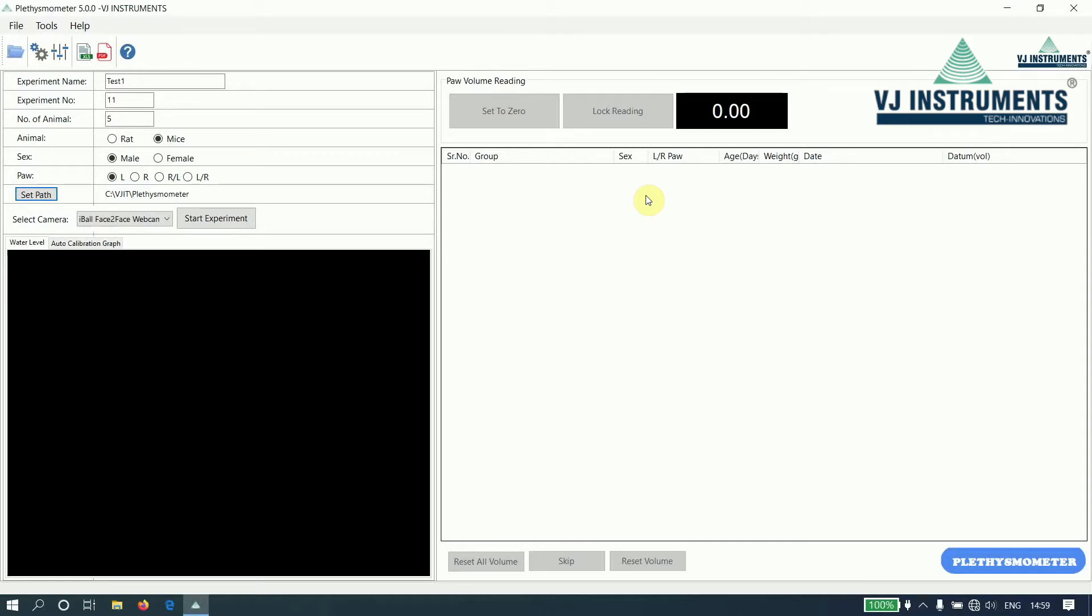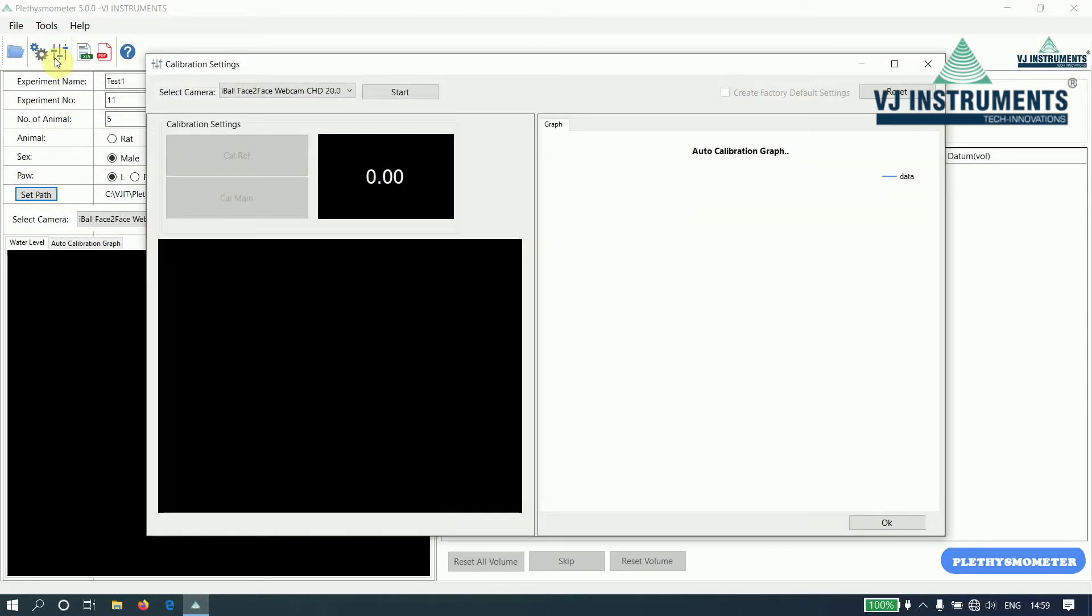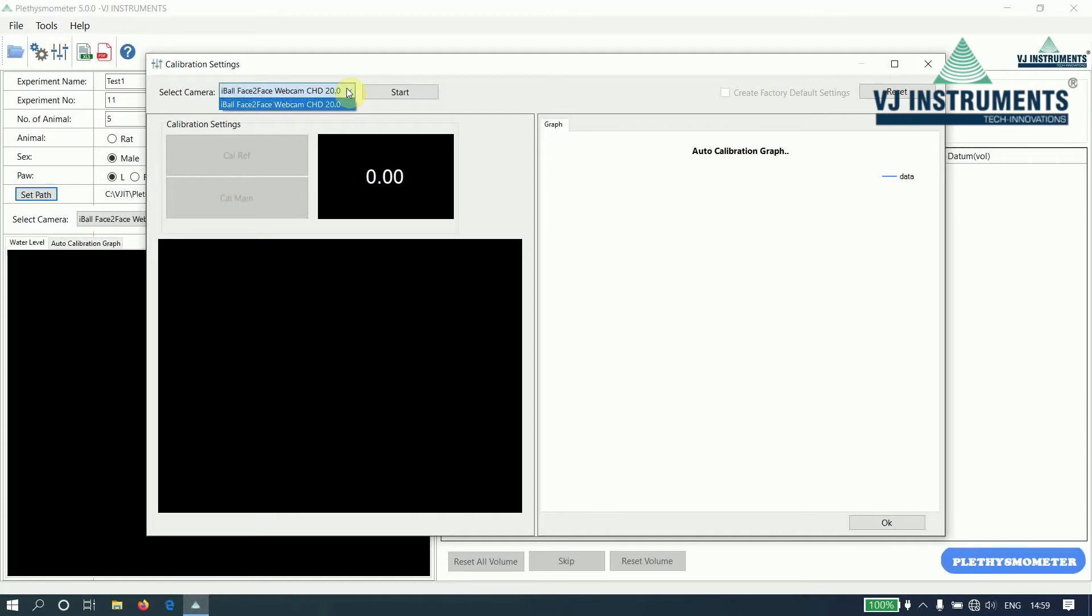Let us now perform calibration settings. To perform calibration settings, click on the option available in the toolbar. The calibration settings window appears. Select the camera of the device and click on start.